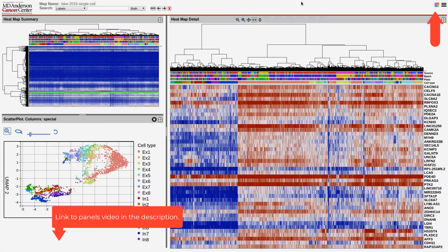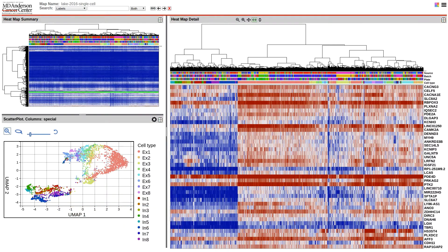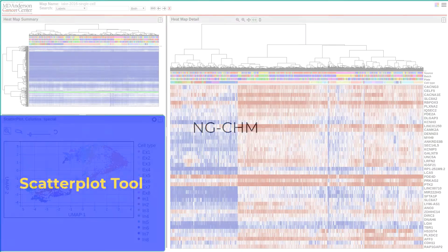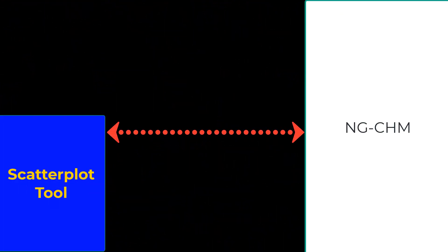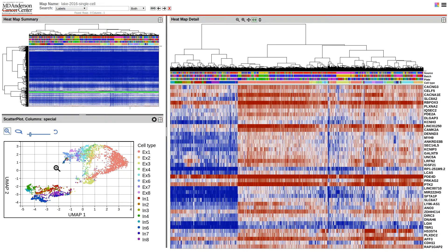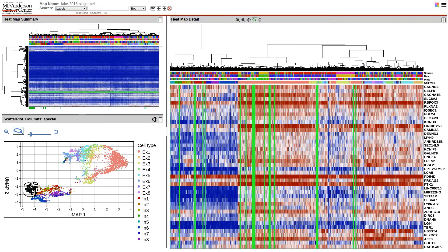This example shows a heat map of single-cell gene expression data with an additional panel showing a U-map plot of the cells. Although the user sees the U-map within the NGCHM, it is actually a separate, pluggable tool that is exchanging messages with the NGCHM on an ongoing basis. For example, when the user selects cells in the U-map plot, they are sent to the NGCHM and highlighted there as well. From the user's perspective it is a single, integrated experience.